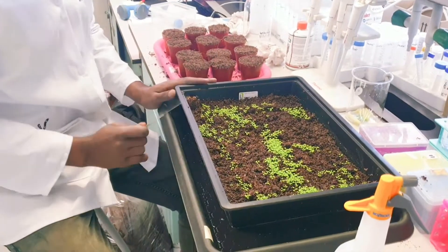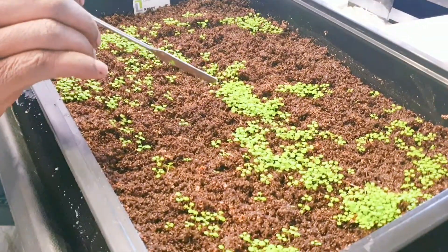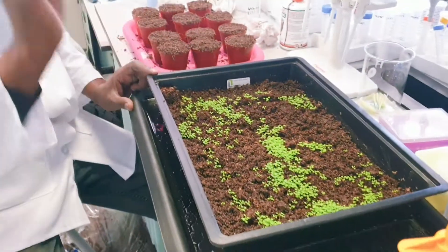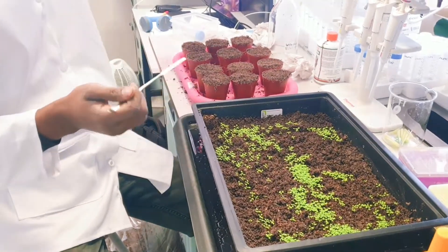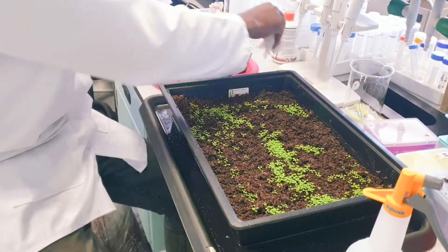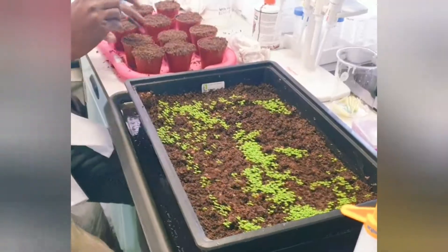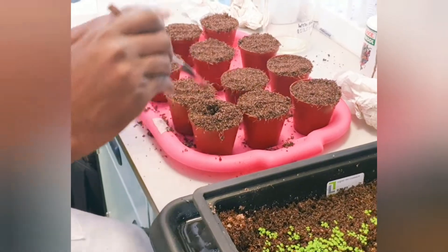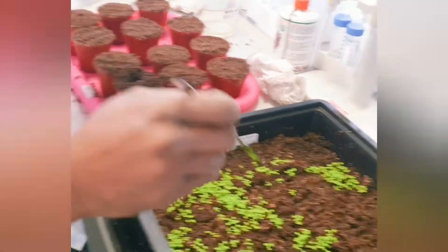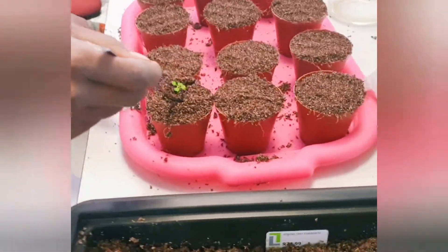This seedling is about two weeks old. I like to transplant when I have like four leaves or more. First of all, I sterilize my spatula to get rid of any contamination or microbes. Then I dig a little hole in the soil, use my spatula to collect one seedling, and place it into that hole.